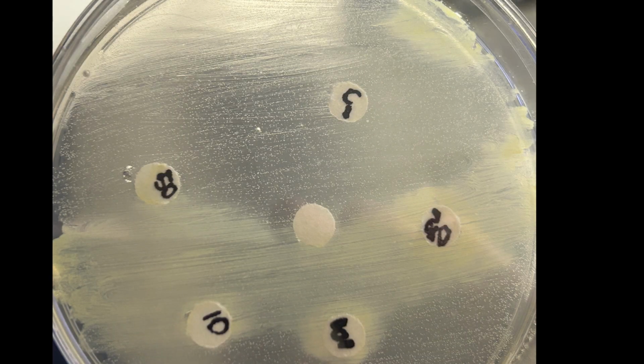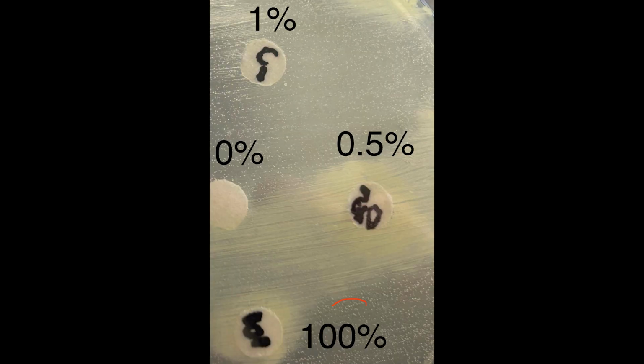The results a day later were very confusing. Instead of having zones of inhibition, I had zones of growth? I decided my stock solution wasn't concentrated enough, and decided to try again. I also suspected that the reason the Micrococcus luteus grew better around the discs is because it's a halophile, which means it loves salt. The PBS buffer I used for the stock solution contained some salts, while the agar didn't. This explains why it grew better in the more concentrated discs, ignoring the 0.5% one.